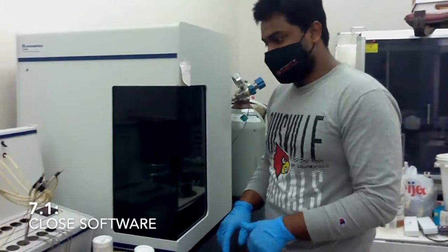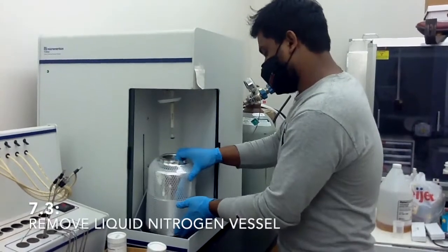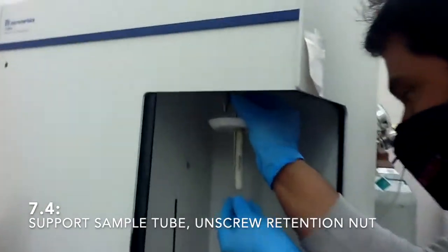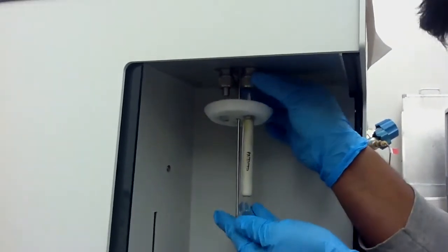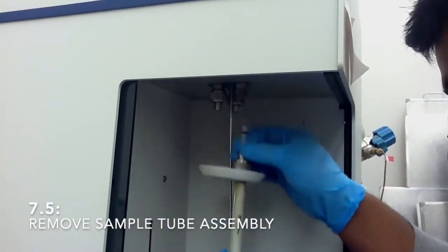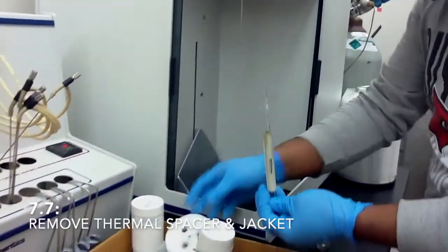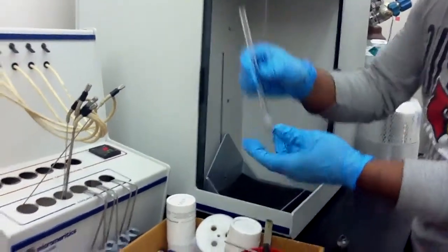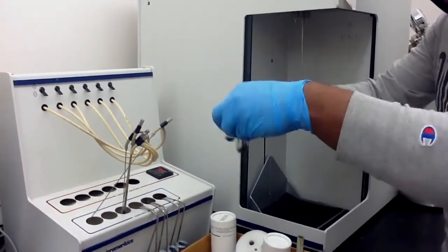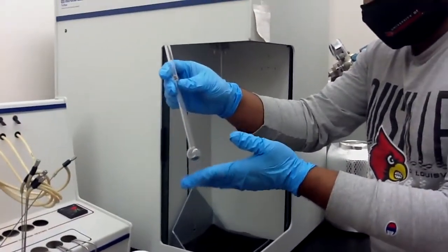So after finishing your sample, you need to open this machine and take out the sample from here. Just hold the tube at the bottom, open it, open the ring, take this out, take the thermal jacket out. So this is your sample. You need to keep it in some tube or wherever you want to. Just put it there and clean this tube so that the next user can use it.